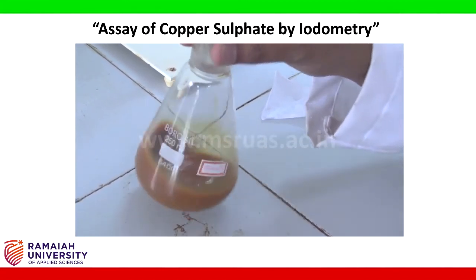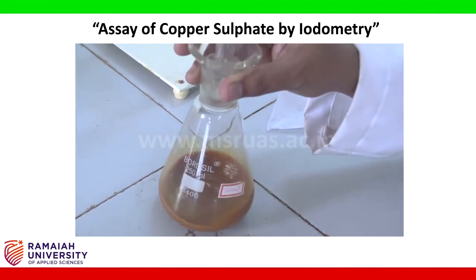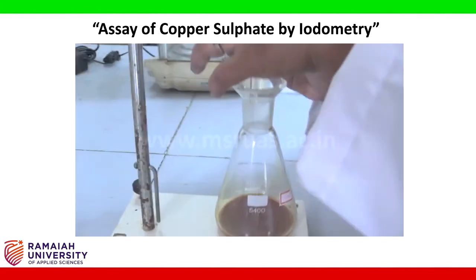Titrate against 0.1 normal sodium thiosulfate until it becomes pale yellow.